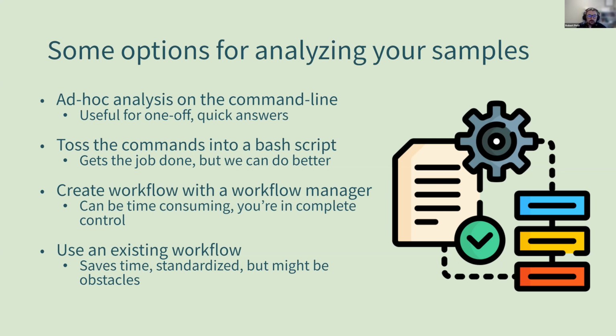And so you can create your own workflow with any workflow manager. I think it's important to state, and it's been stated multiple times today, to choose a workflow manager that you're comfortable with. I think Snakemake and Nextflow are great. I'm just more comfortable with Nextflow, so I chose Nextflow. But this could be quite time consuming, making a new workflow from scratch. But you do have the benefit that you're in complete control, so you can configure it as specifically as you want to your needs.